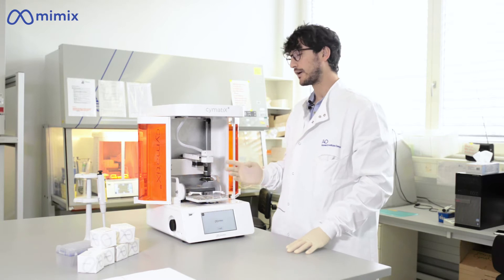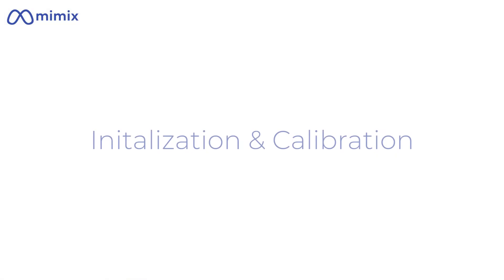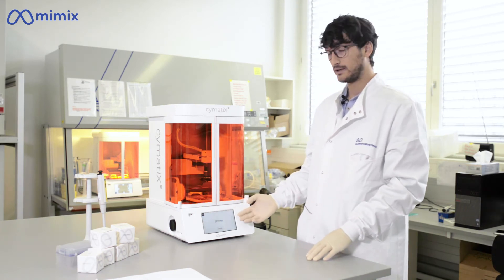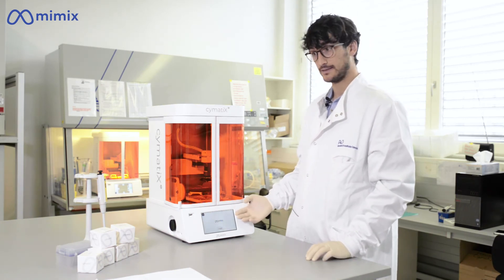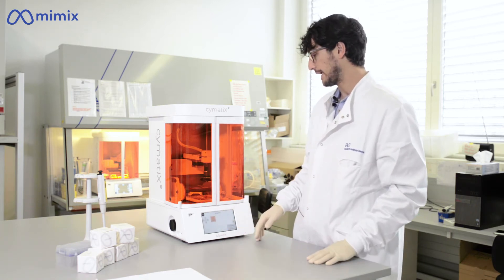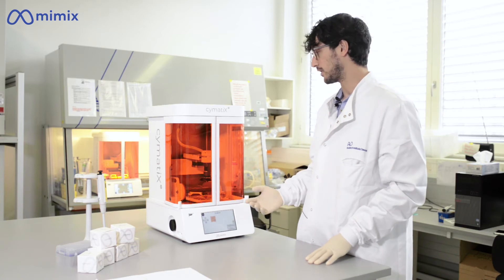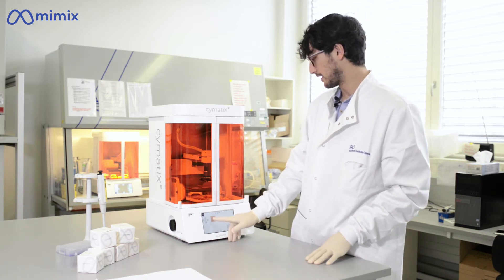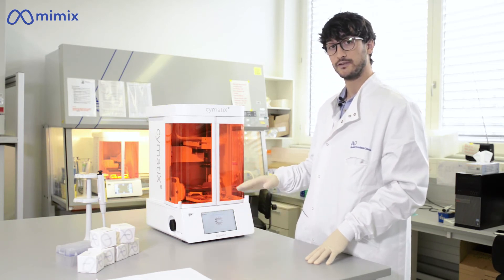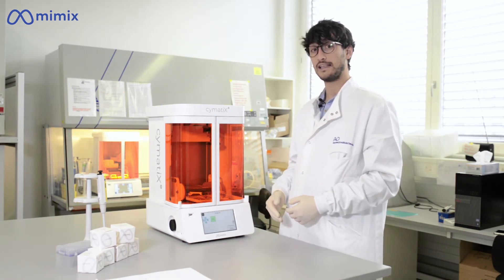The UV module allows you to choose over four different wavelengths for your light crosslinking. After the machine is started up, you will see the login interface in which you can log in with your personal account. The first step is the initialization and calibration of the mechanical movements of the device. You can do this through the interface and wait for the different components to calibrate. After the calibration is successful, you can go ahead with the next step.